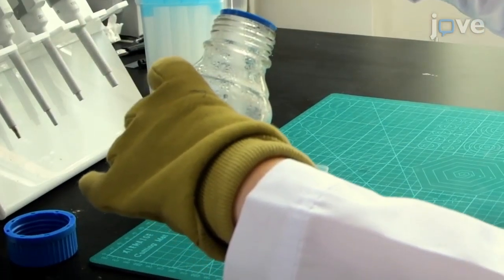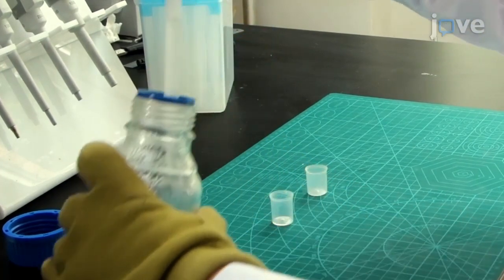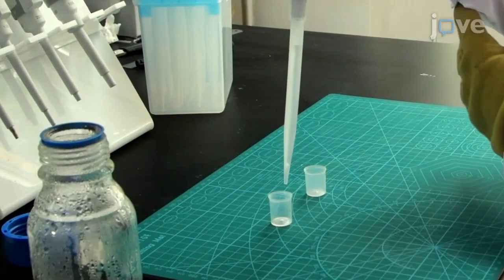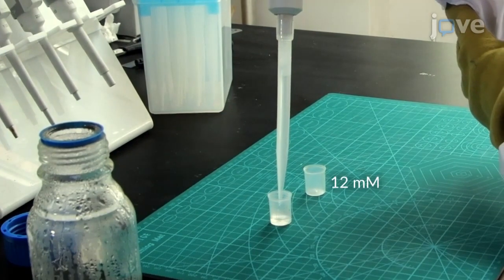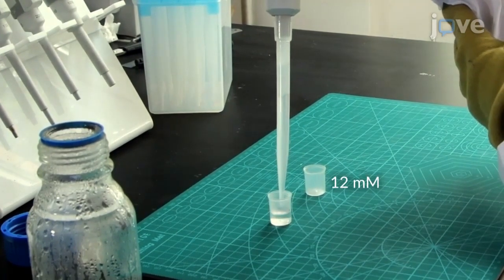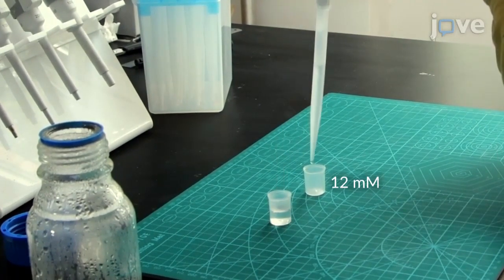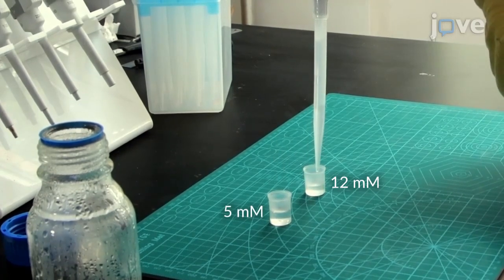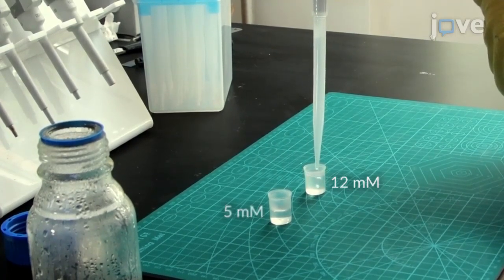Pour 1% agar into the FBOC to adjust its depth. If food needs to be placed in the FBOC, pour the agar to obtain a depth of 12 mm. If food does not need to be placed, pour the agar to a depth of 5 mm to track the whereabouts of fruit flies more easily.